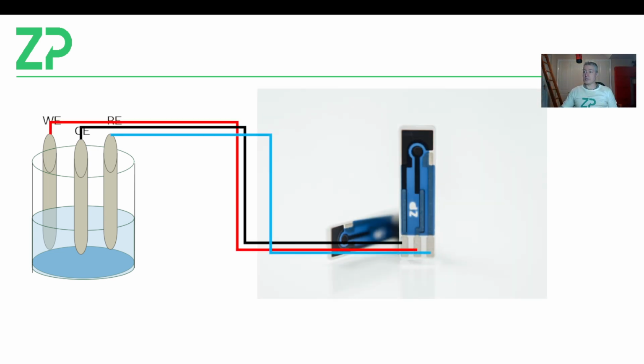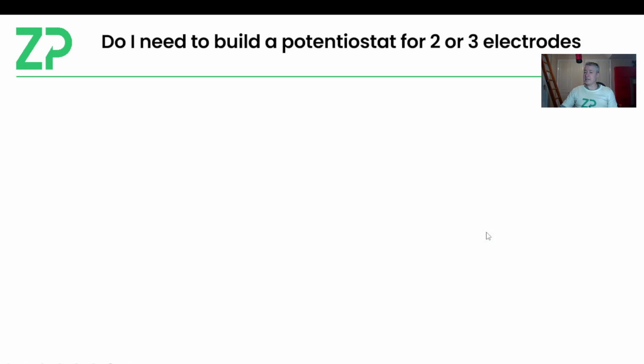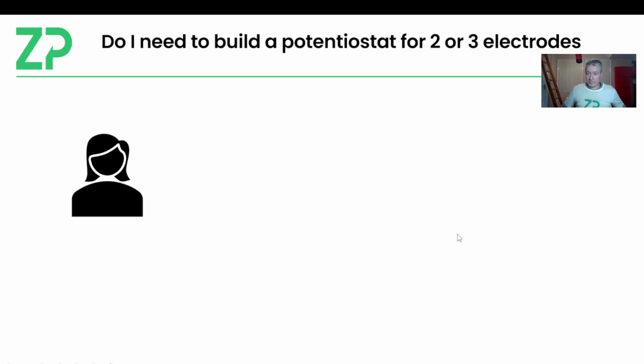The good thing about a screen-printed electrode, though, is that you can really reduce the size of that electrochemical cell. When I did that ferricyanide experiment earlier on, I was only using 50 microliters. In a minute, I'll do a quick test on some milk and some peracetic acid, and there again, I'll only be using 50 microliters. Now, they do have these technical questions about membranes and stuff, but I mean, at ZP, we're already, and I'll do a peracetic acid experiment at the moment.